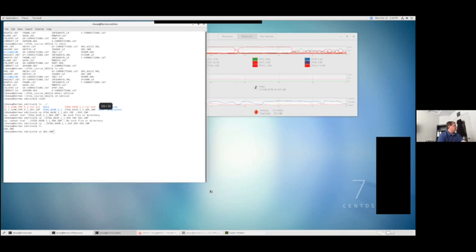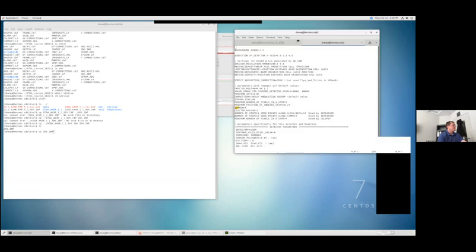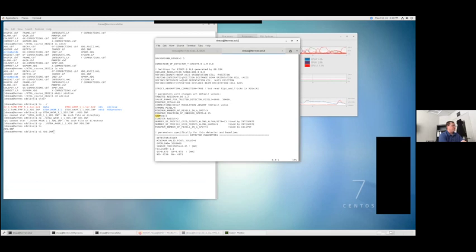You can use any command line editor. If you prefer GUIs, I think the most common one is gedit, which will do a graphical editor. It's fairly simple. I think this is an example of gedit. So I had it open for a different one. So you can just see I can, in here, use my arrow keys to move around or just click on a position. Or you can't click, you can move it around, but then I can get in there and edit it.